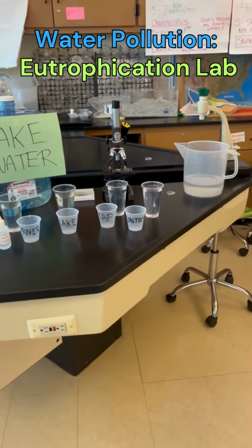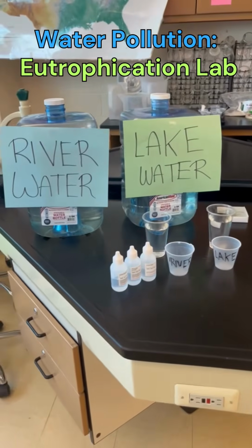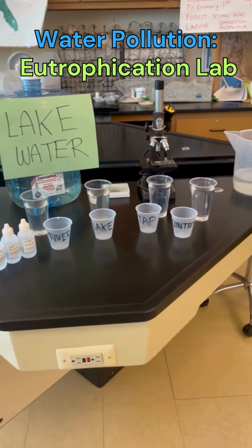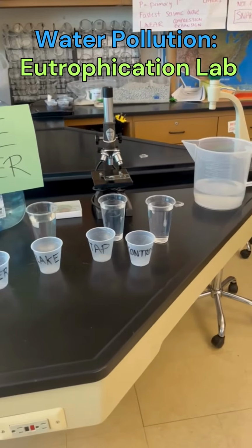Here we have my setup for my eutrophication lab, part of water pollution, environmental science, and this is for my juniors and seniors in high school as an upperclassman elective. Now this is a great lab, simple to set up and simple to analyze and observe.